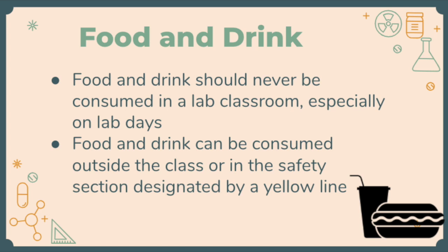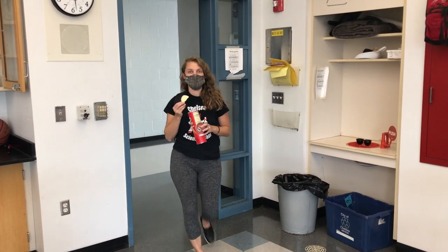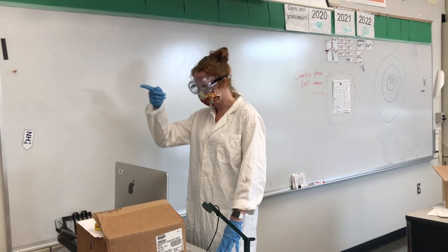Unlike in other classrooms, food and drink should never be consumed in a lab classroom, especially on lab days. Food and drink can be consumed outside the class or in the safety section designated by a yellow line. Have students throw away or store in their backpack the remainder of the food.